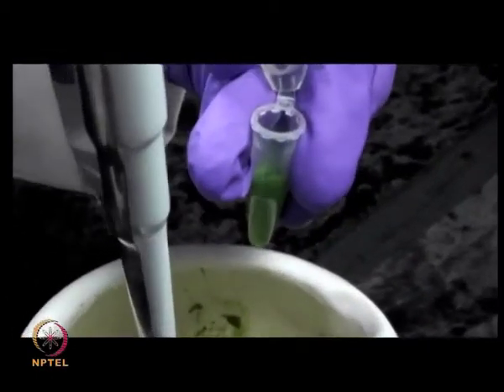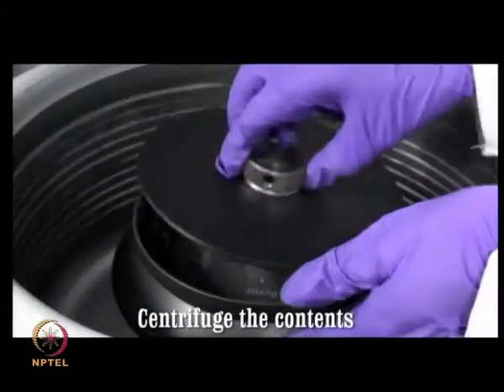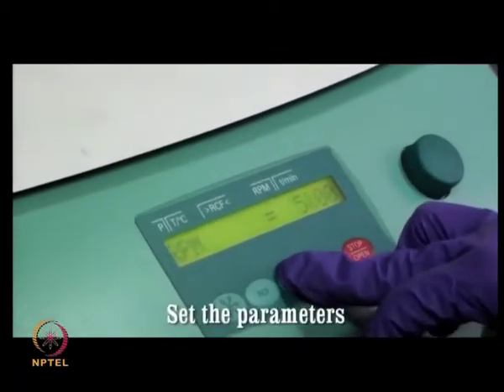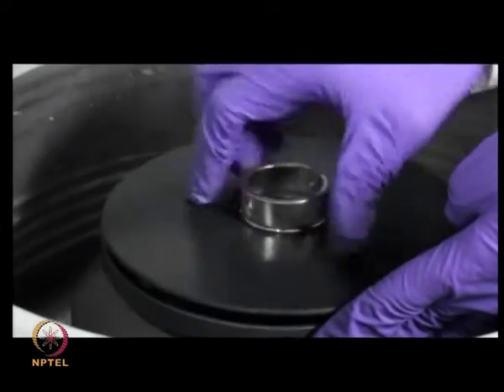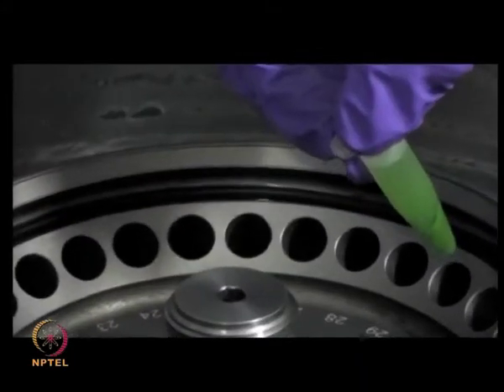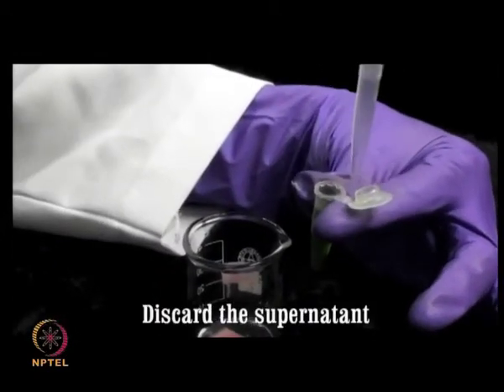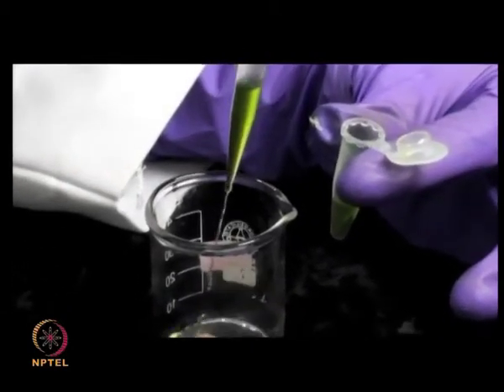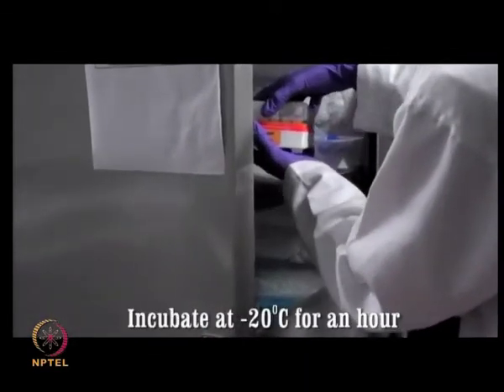Centrifuge the sample at 10,000 rpm for 5 minutes and maintain a temperature of 4 degrees Celsius during the process to ensure that there is no denaturation of the proteins. Discard the supernatant and retain the pellet containing plant proteins along with various other intracellular components. Incubate the pellet at -20 degrees Celsius for an hour.